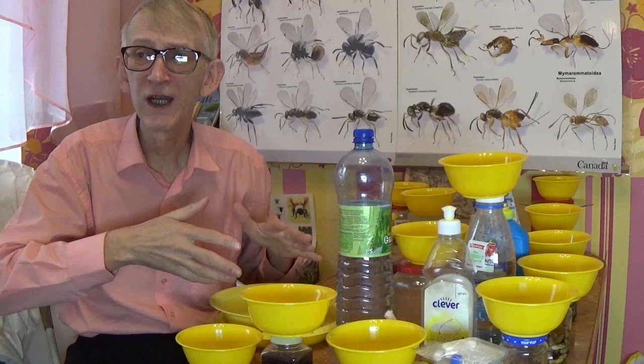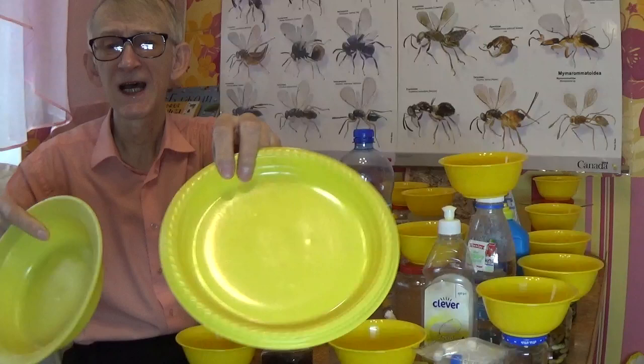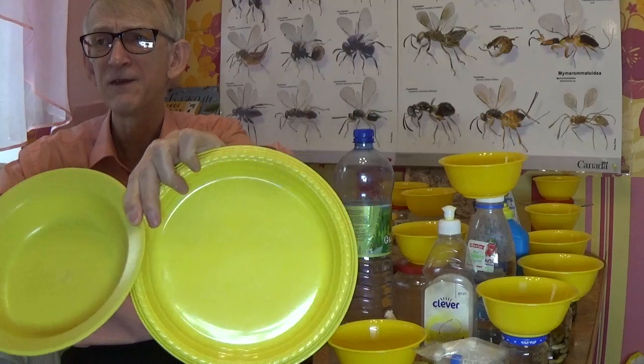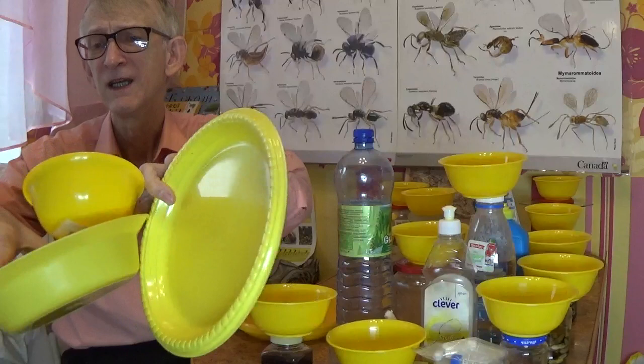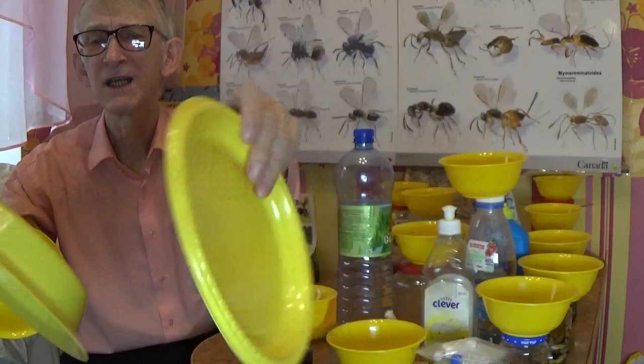Let's start from the beginning with these traps. They can be different sizes — approximately 10 to 20 centimeters in diameter — and different materials: some are strong plastic, some are very soft plastic. I can also use very cheap one-use plastic plates.